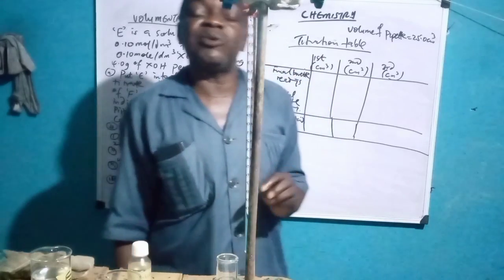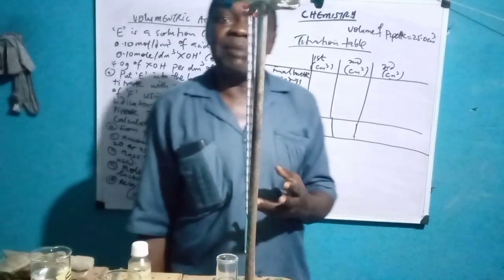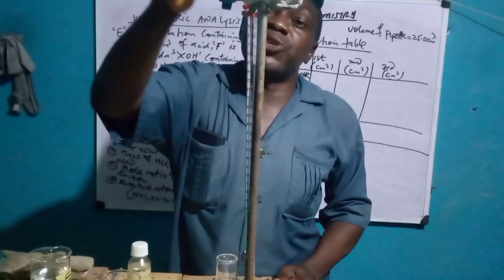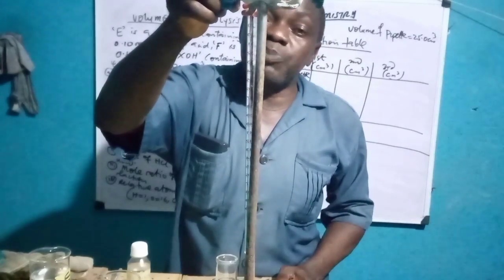Go through them and really understand the precaution. However, as many as I can remember in this video, I will also chip it in. So for example now, before you start, you must rinse the burette with the acid to be put in it.